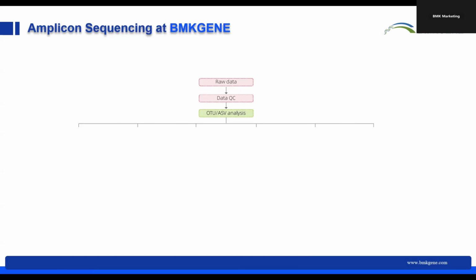And this uses a denoising model to handle the sequences. So both are available, again, depending on the preference of each researcher. And doing this analysis will give us the taxa that are present in each sample and also the relative abundance of those taxa. And that's what enables us to then perform all the downstream analysis that I'll show you here.